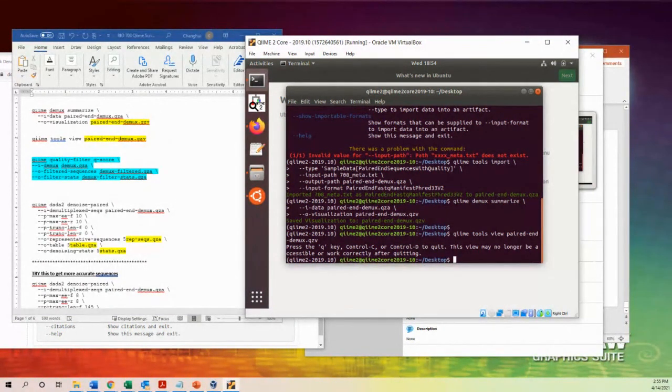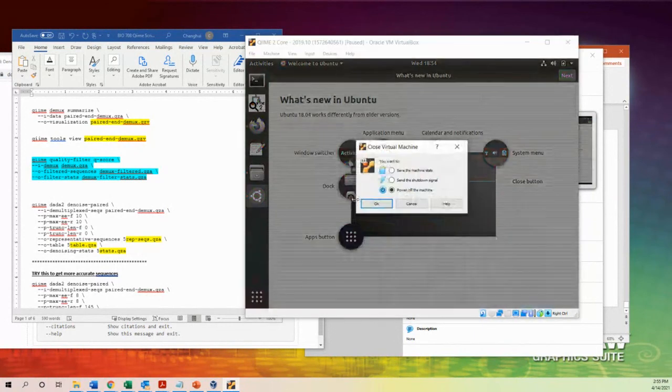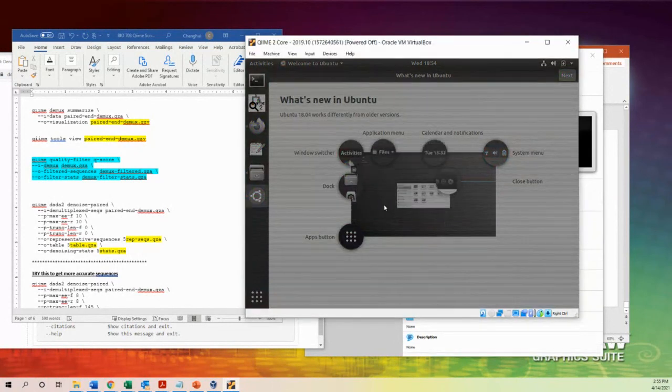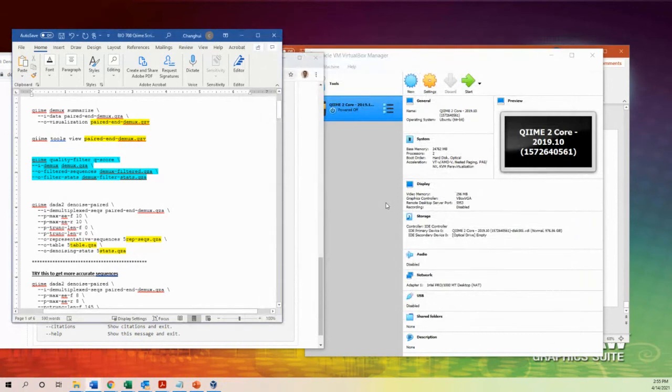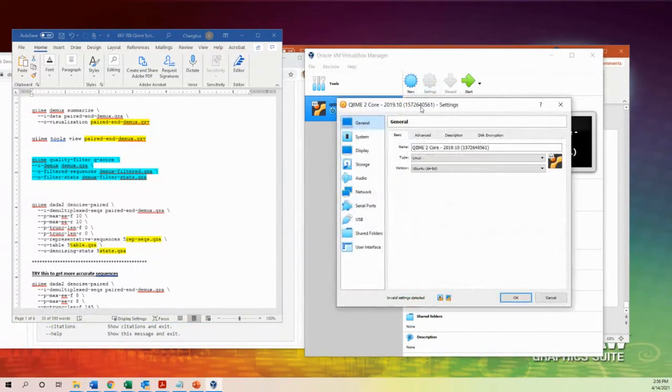All right, any other question? I have a question. It's not letting me paste the commands. Sorry, Talia. It wasn't letting me paste the commands. I was following along with what you were explaining. It doesn't let you copy and paste? Correct. So did you go to the setting and then go to the general advanced?